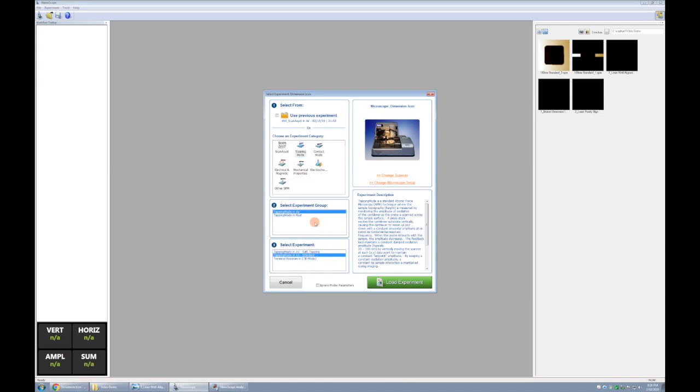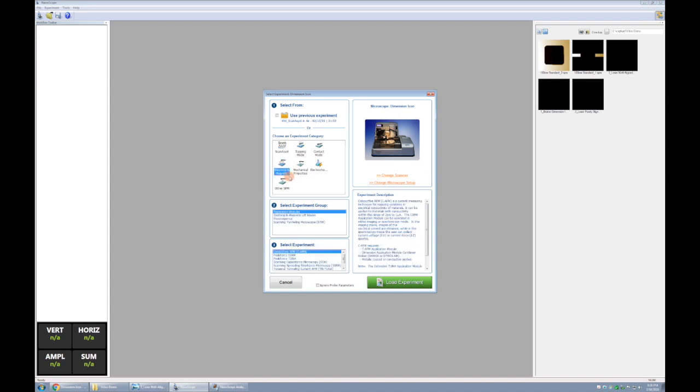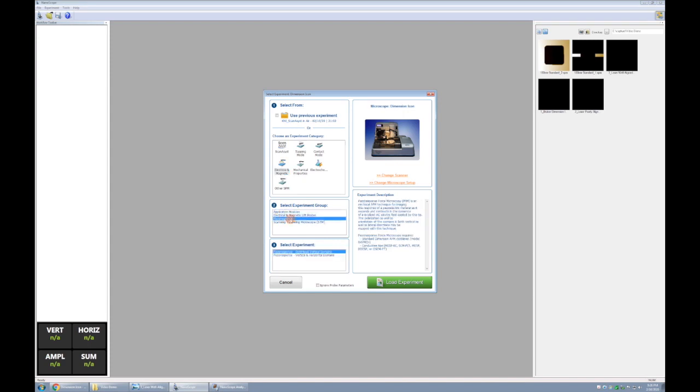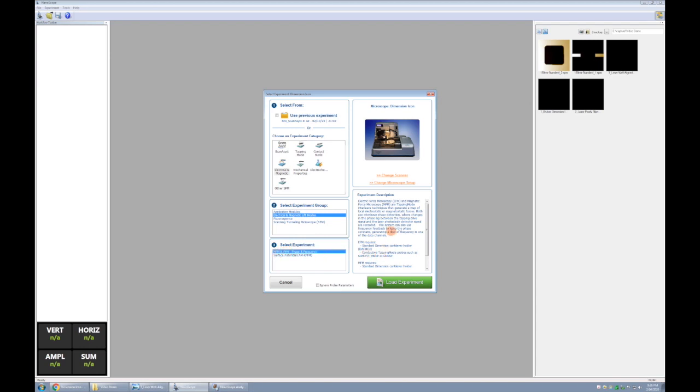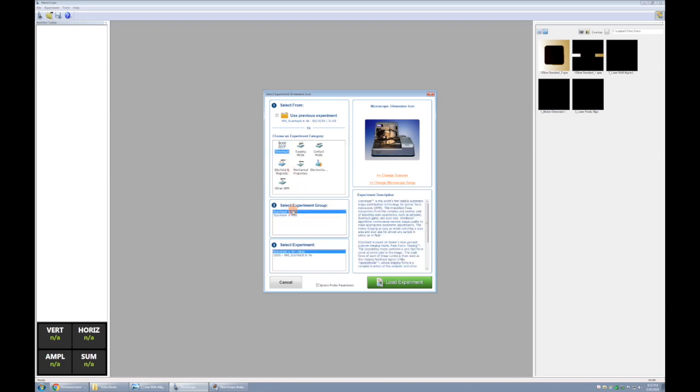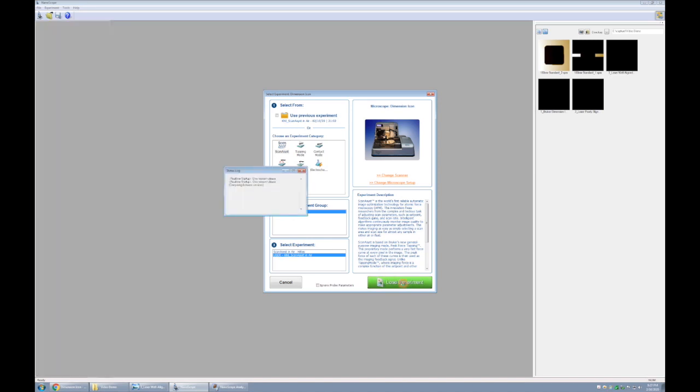We also have other kinds of scanning probe microscopy available. We can click this electric and magnetic experiment category. We can choose piezo response microscopy, or we can click here and choose, say, magnetic force microscopy, and it'll tell us what we need to do in order to do that type of microscopy. All right, so we'll do scan assist, scan assist in air, KNI scan assist in air, and load the experiment.